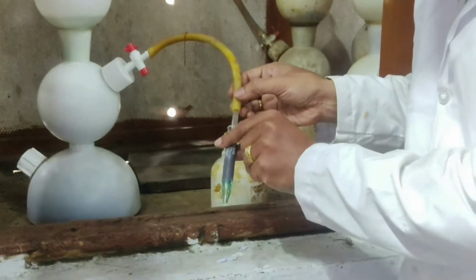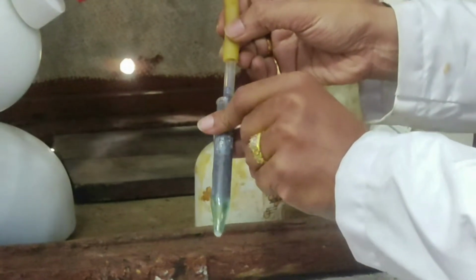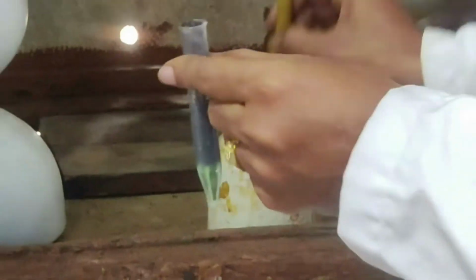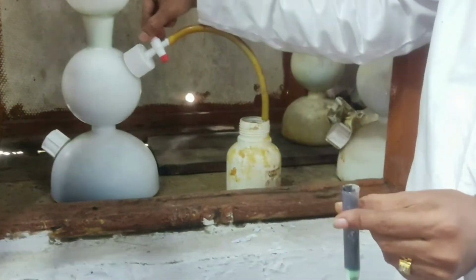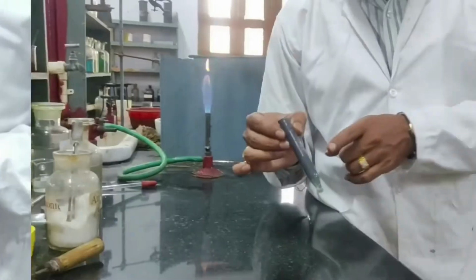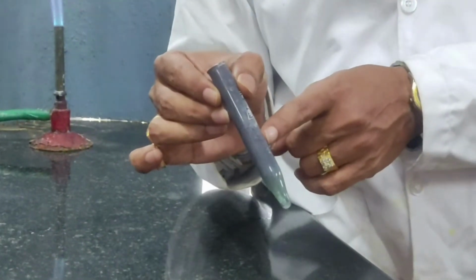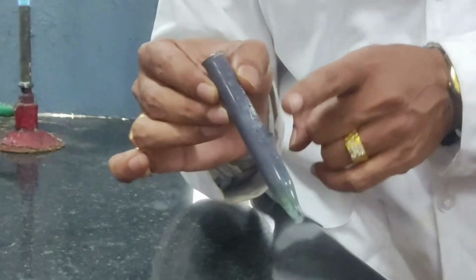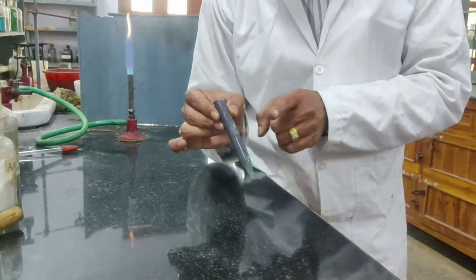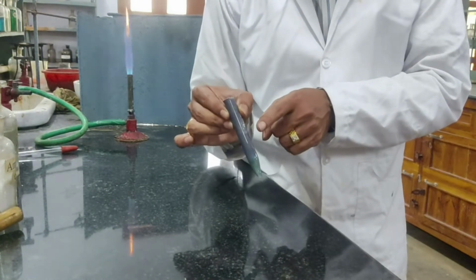You can see the precipitation also. H2S gas is passed and then you can see the precipitation. Don't forget to turn off the knob. Very important, right? So after passing H2S gas, I got a precipitate, which implies fourth group cations are present in this. I need to centrifuge this now to get the residue in which fourth group cations are present.